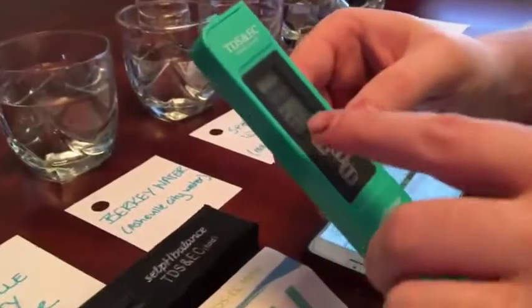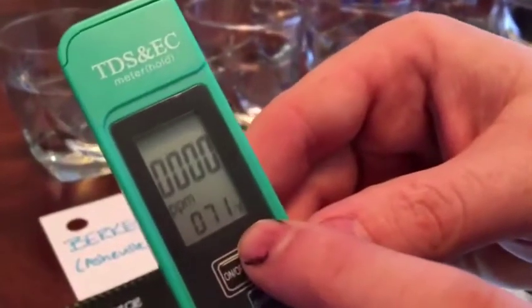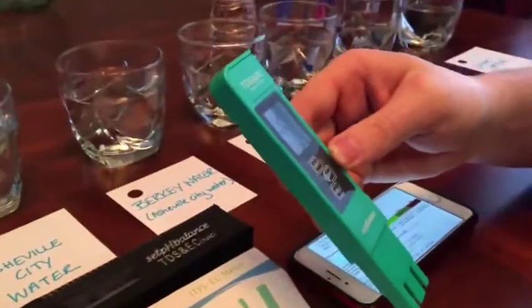Okay, so first thing we're going to do is turn it on. We're already right now on the total dissolved settings. You can tell by the ppm reading. That's the measurement right there. It's also giving us a temperature as well. That's real neat. That's not normal, and I do like seeing that.